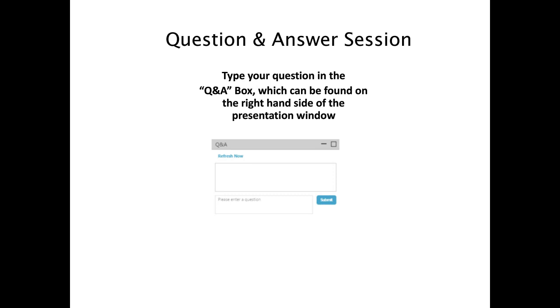The next question is, why is the gradient delay volume important? Well, I think the gradient delay volume is important to know because you want to document it so that anybody else in your own company, or if you're publishing it, or if you're transferring it to another location at your own company or another company, that they can repeat it. Once they know what their delay volume is on their instruments, then they can make the adjustments in the conditions so that they can closely or relatively closely replicate your separation.